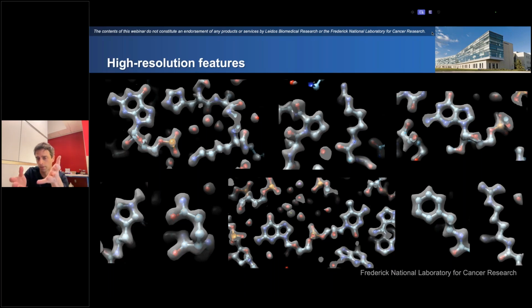And obviously for the arginine in the center, if you try to fit those individual carbons into the center of the density, you would end up with a non-physiologic distance, right? So you'd have to break the bond. So we know that for that one, it's not right. But for other ones, it's not so clear, especially in the core of the particle, where you're at beyond 1.5.